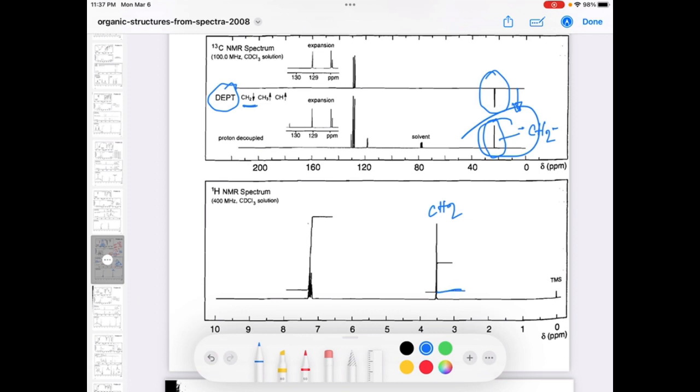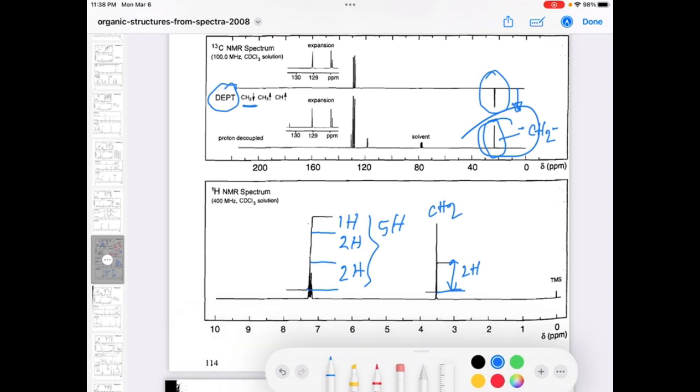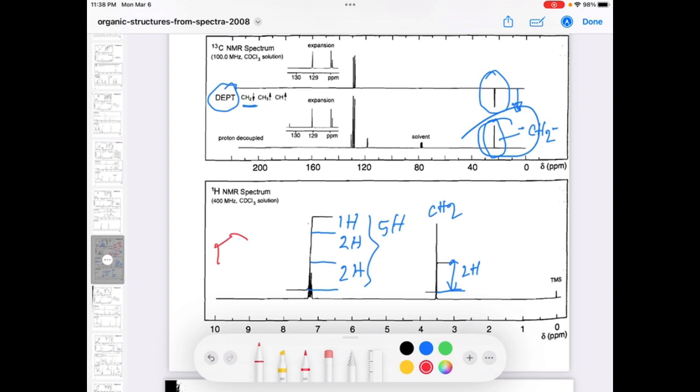Another way, since we know the aliphatic carbon is CH2 carbon, that means in the proton spectra, that peak is for the CH2, two hydrogens. If you think this integration value, the integral length, is for two hydrogens, if you consider the aromatic region, maybe equivalent to two hydrogen and there is another equivalent two hydrogen and one hydrogen, so total five hydrogens.